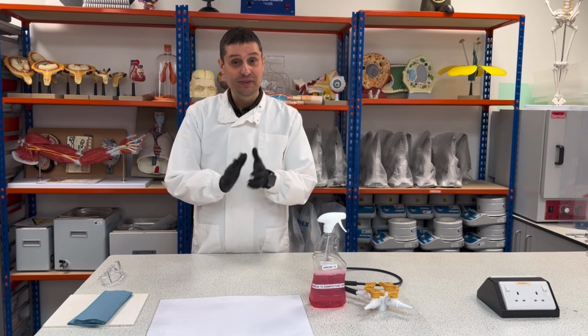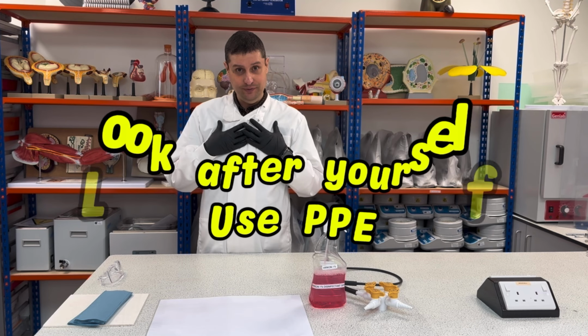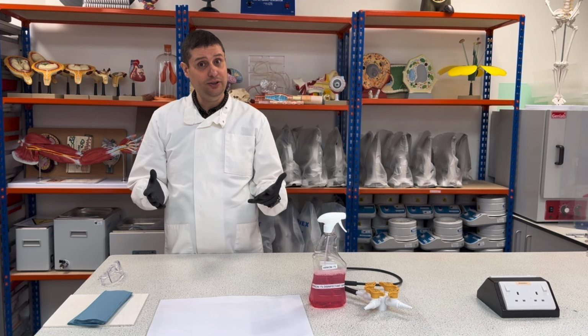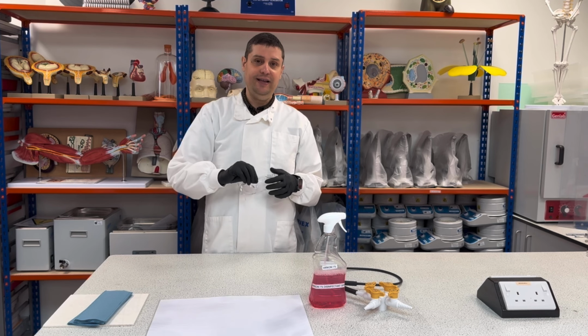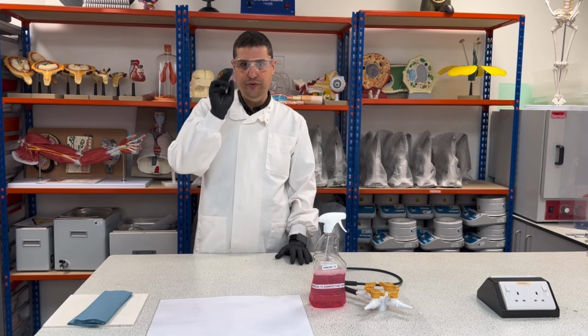So let's start. The first thing I need to do is look after myself. So I need my PPE. What's the PPE in this practical? Gloves to avoid contamination and specs. Why are the specs necessary? Two things.